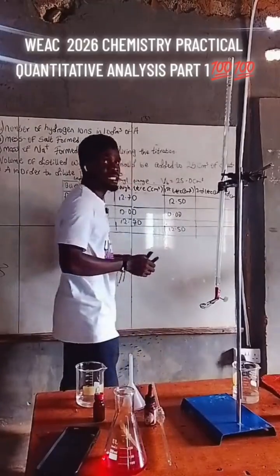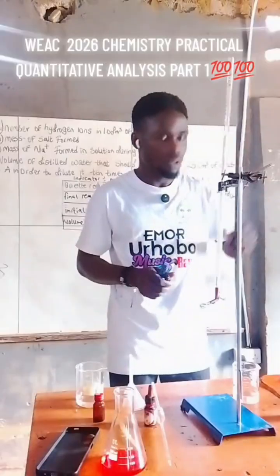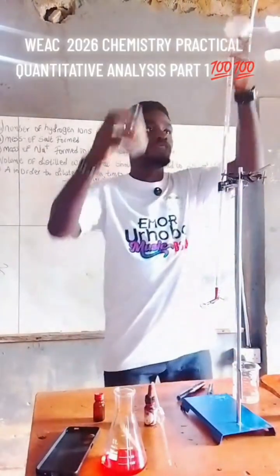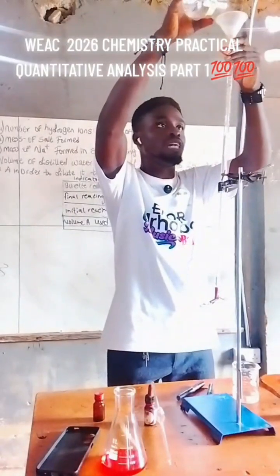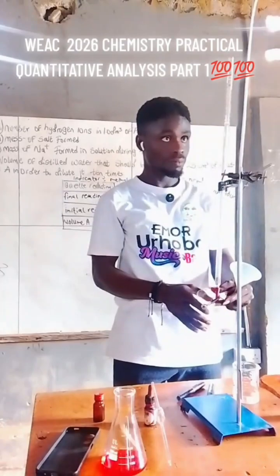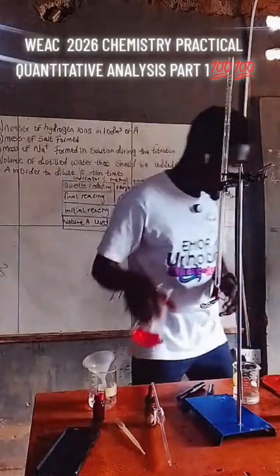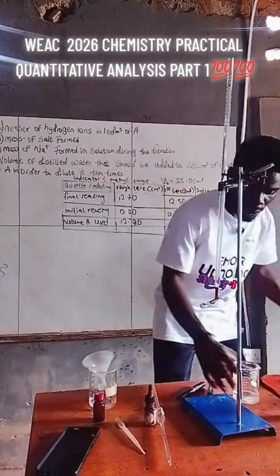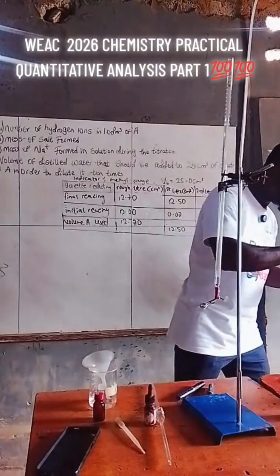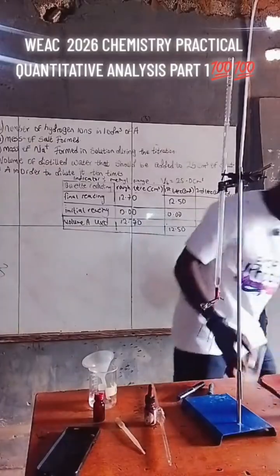12.50 again, abi. Now at this point, listen, we can start our initial from here again, or we can refill, like I said, we can complete it to 10, right? Let's just fill this to 10 and start our initial for the second titration from what? From mark 10 cm cube. Then at this point we have an initial of 10. Yes, for the second titration, to avoid error.